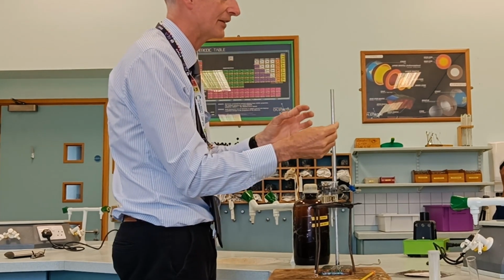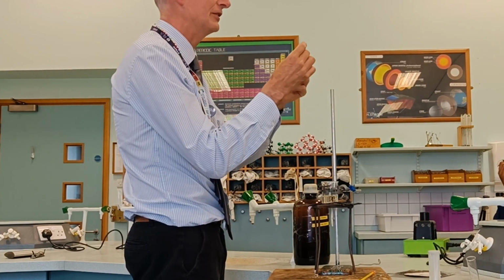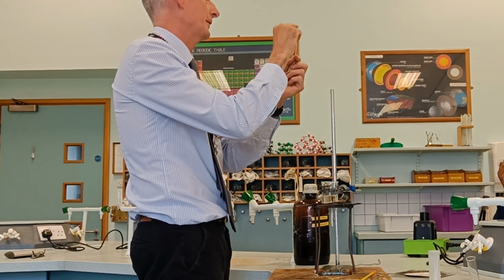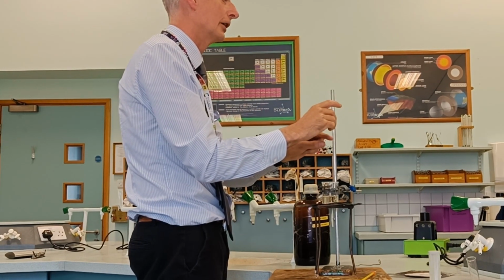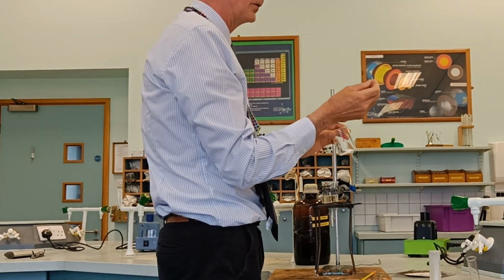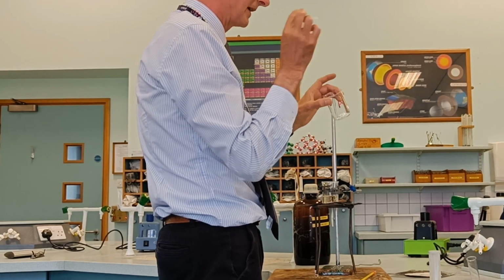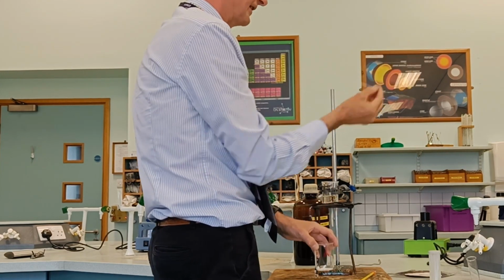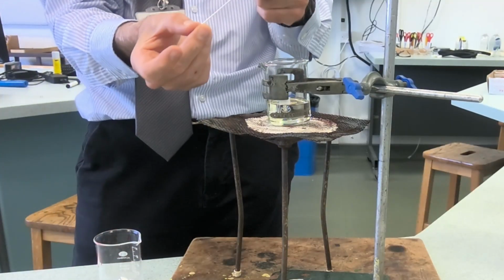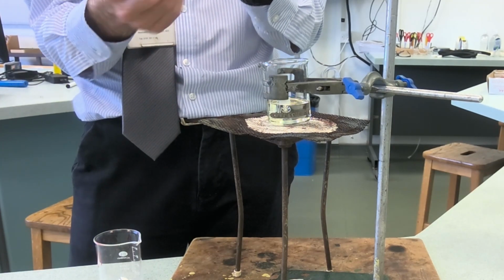So what we want to do is get a small sample of the material that we want to test into this capillary tube. Of course, it's got to go in at the open end, and then we want to get it down to the closed end. So here's a sample, and I'm going to push the open end in and tap it. Of course, you get a little bit of the stuff stuck in the wrong end, so now we've got to try and get it down to the right end.